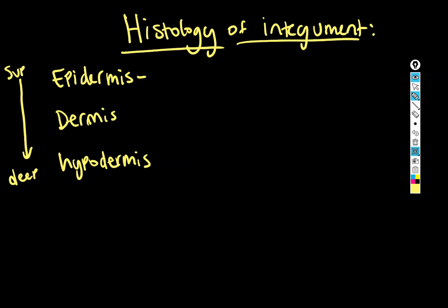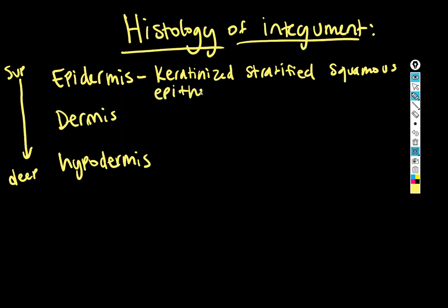So the epidermis is actually a specialized epithelium, and that is the keratinized stratified squamous epithelium.